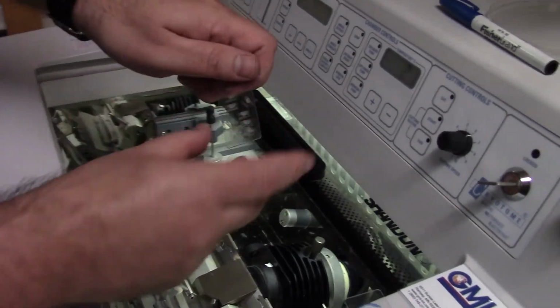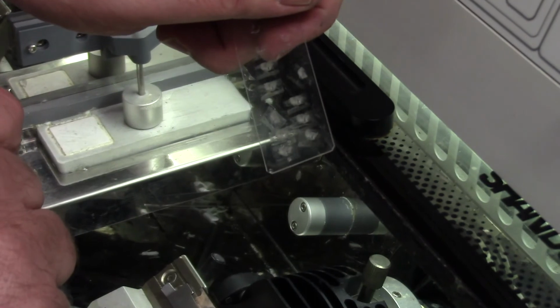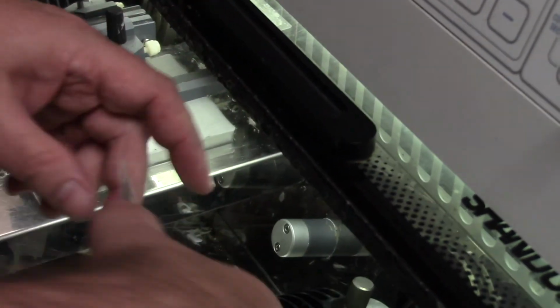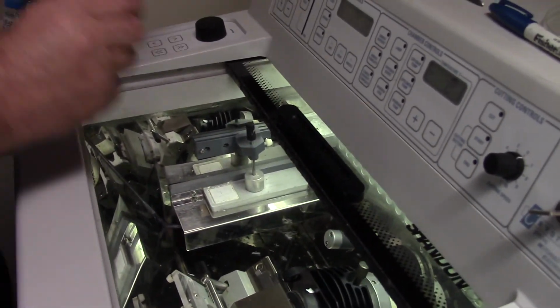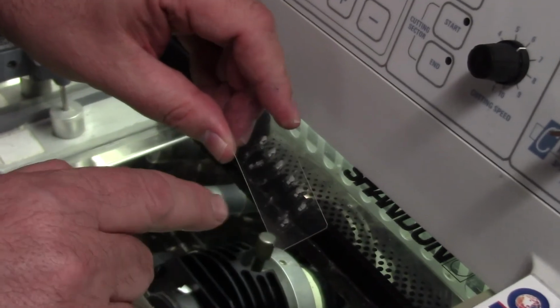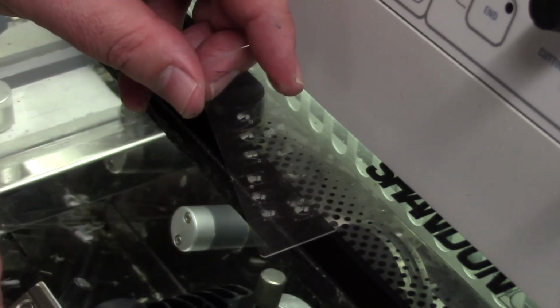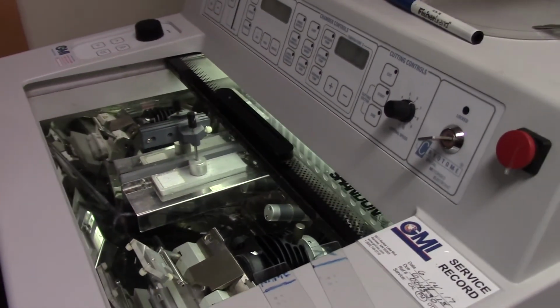Look how full that is. Sections all the way. Now, this was one I let students demo on. They didn't always put it on straight. How do you pick this thing up, right? Okay. Here's another one with multiple rows of tissue, right? Oops, I got it upside down. There's our tissue.